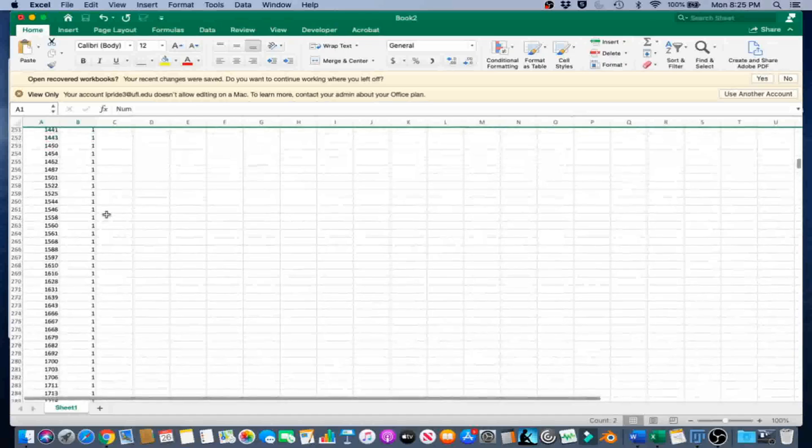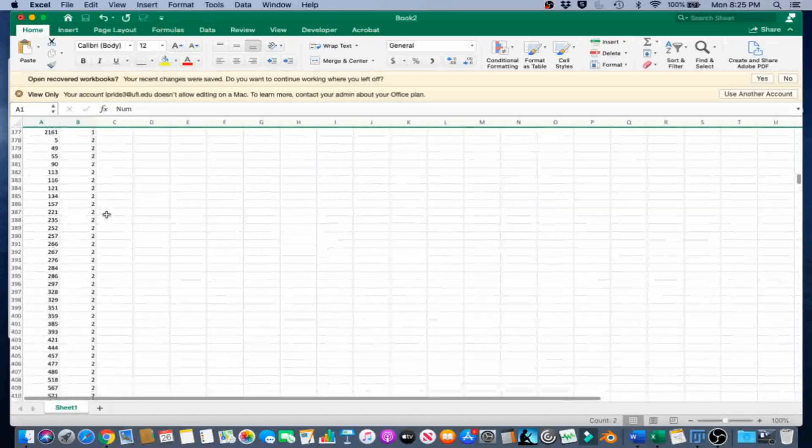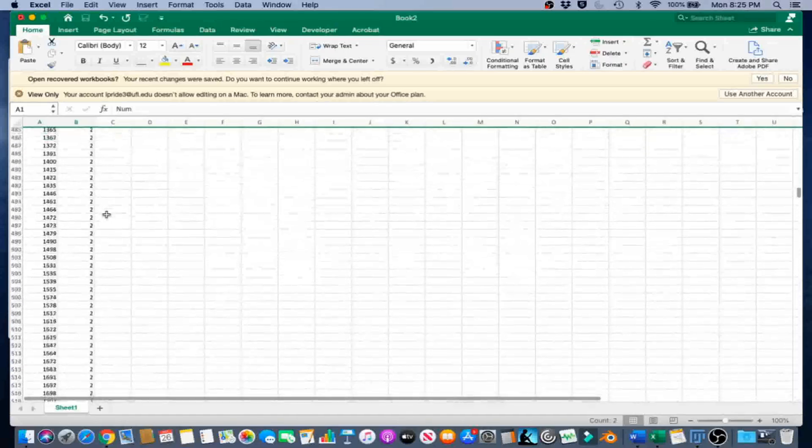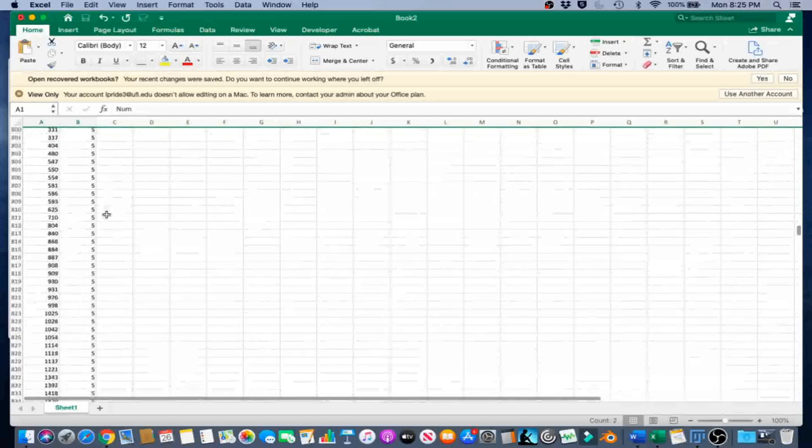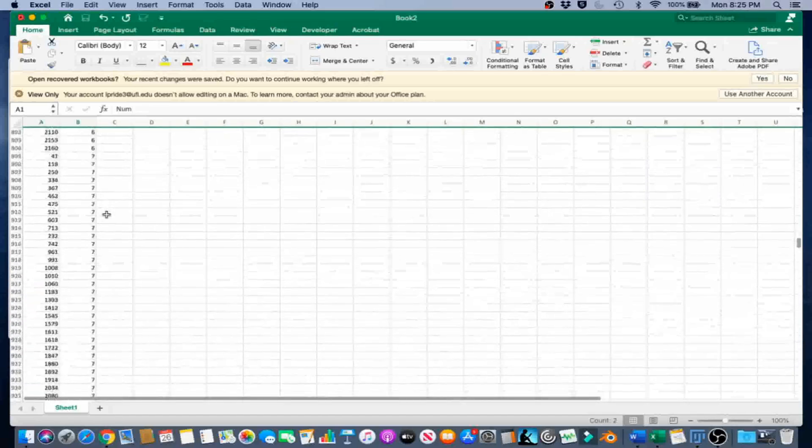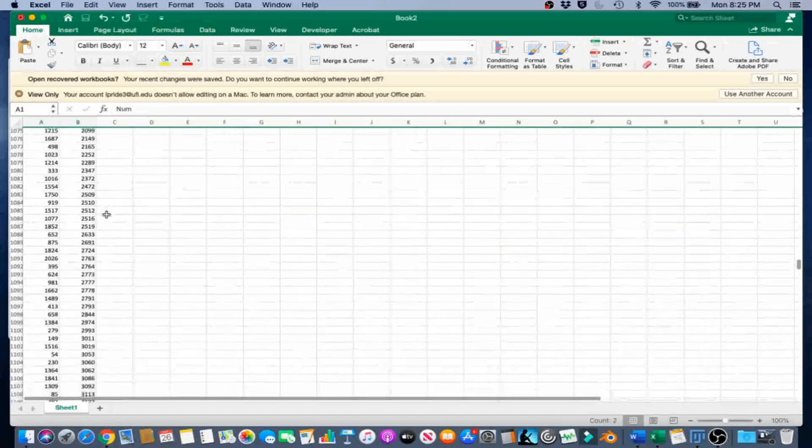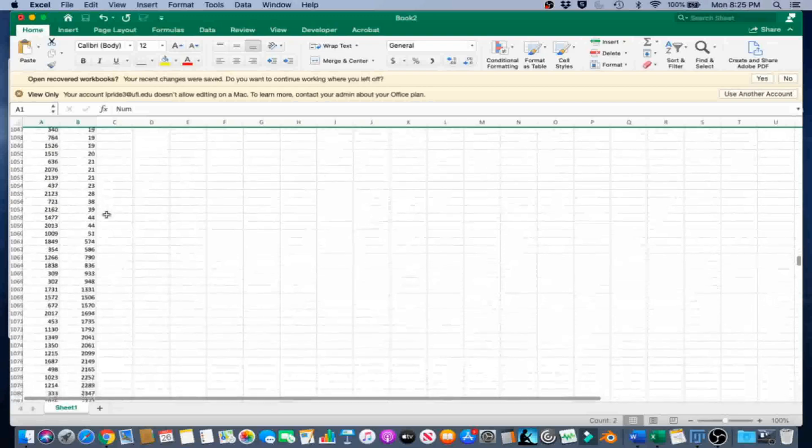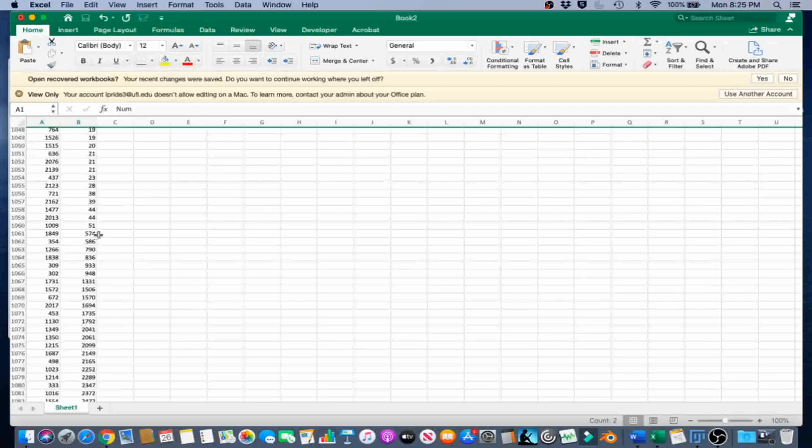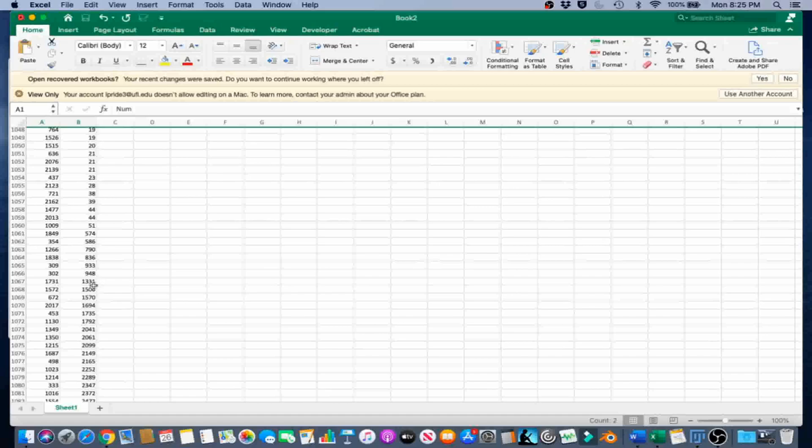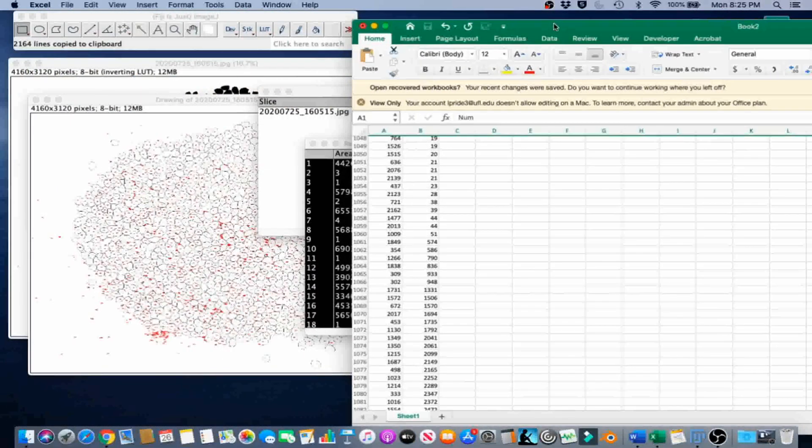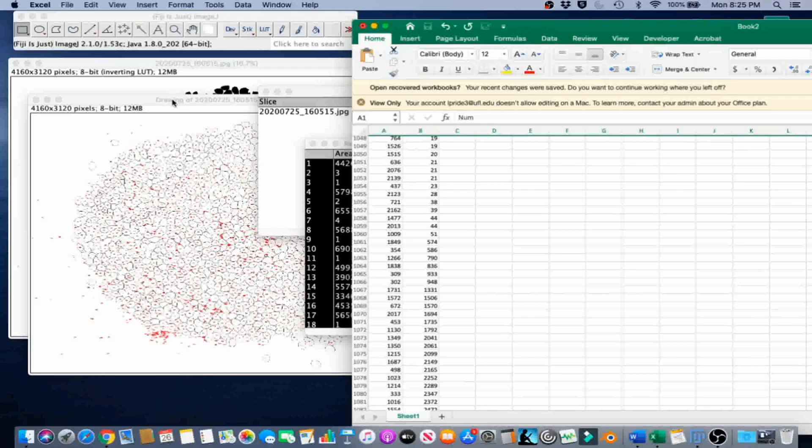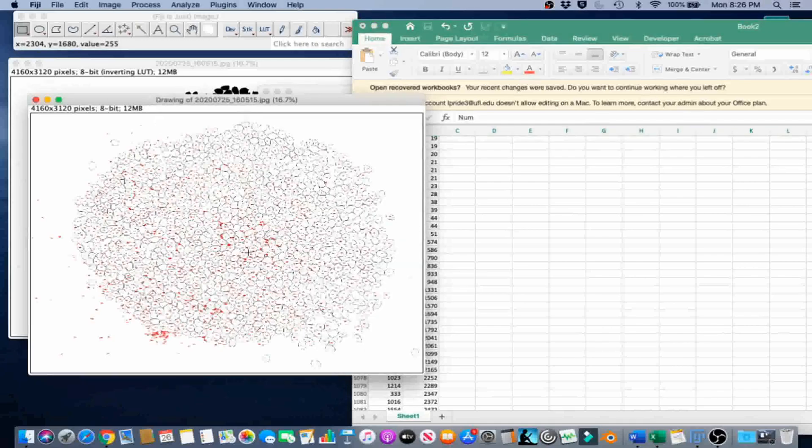So you have a lot of 1, 2, 3 pixel stuff, and it starts to climb. Then right here we see it makes a jump from 50 to 574, and then again from 948 to 1331. We're going to check out the area 1331. We're going to look for number 1731 in order to do that.